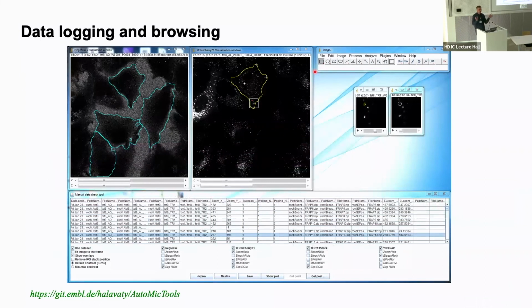It's a tab-separated text file, which can also be used for the follow-up analysis to know which low resolution image corresponds to which high resolution image, and what were the points used for bleaching, for high resolution imaging, and so on and so forth. The dedicated regions can also be stored as imaging ROIs, and in this case, this table will not only know about image files, but also about these ROIs.